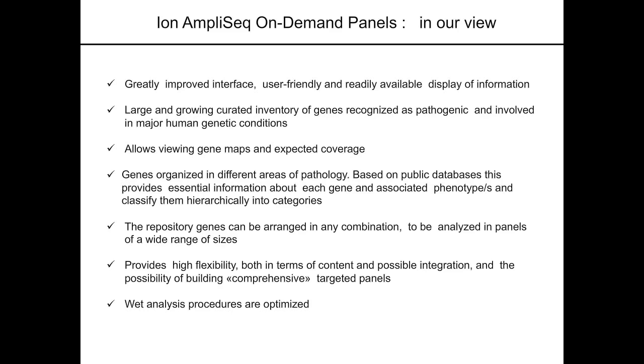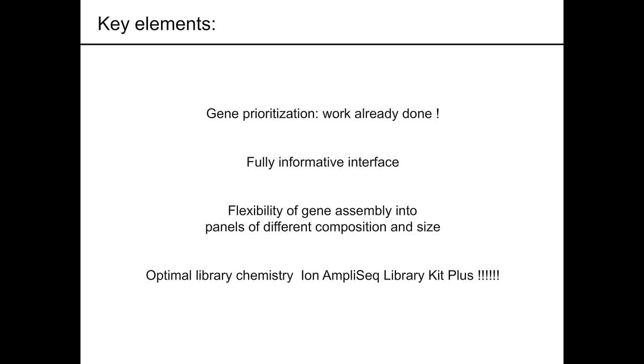And the wet analysis procedures are absolutely optimized. So the key element, the gene prioritization, is a work that we find done already. So this is a big part of what we used to do, and it's a fundamental help.